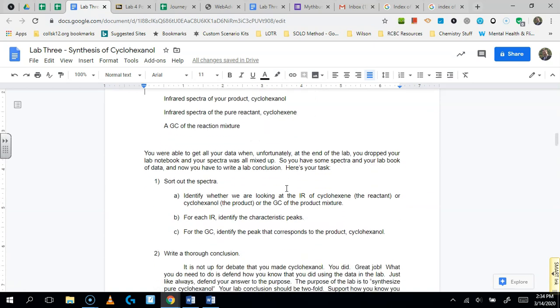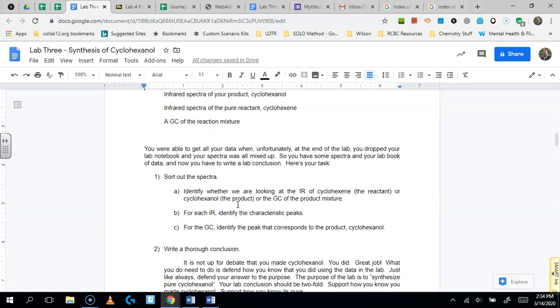So you're going to sort out the spectra. You're going to identify whether we're looking at an IR or a GC. And then for the two IRs, you're going to identify which one is the cyclohexene, the reactant, and which one is the cyclohexanol, the product of the reaction. And then for each of those IRs, I want you to identify the characteristic peaks.